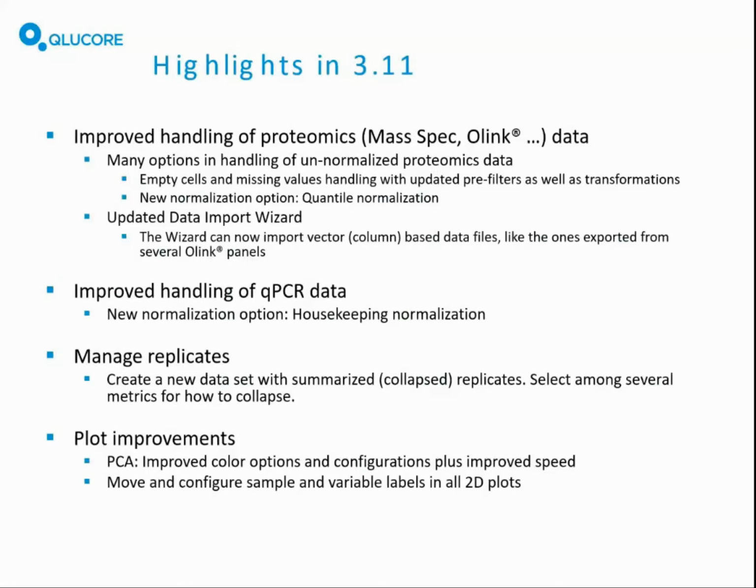You can also manage replicates in the new version. You can collapse data on the sample side. You have always been able to do that on the variable side, but now also on the sample side.